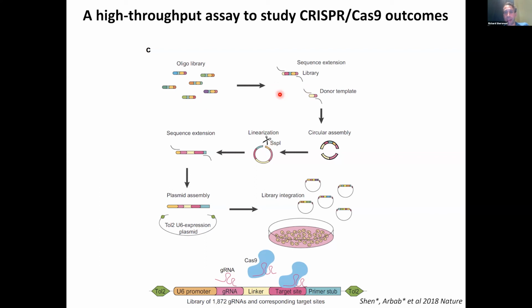When we amplified the oligonucleotide, we could cut it with this SspI enzyme, and using a Gibson assembly step, insert the region that we wanted in the middle, and then break it open again, such that we could amplify this entire linear piece that now included the fixed chunk in the middle, and pop that into a vector.